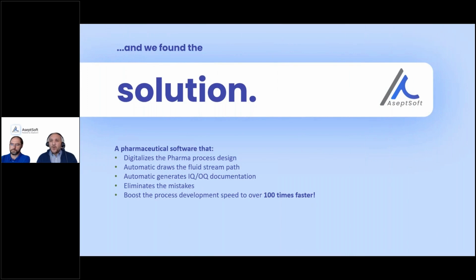After a lot of brainstorming exchanges with colleagues from the pharma industry, we found and tested a real state-of-the-art solution for the process design.